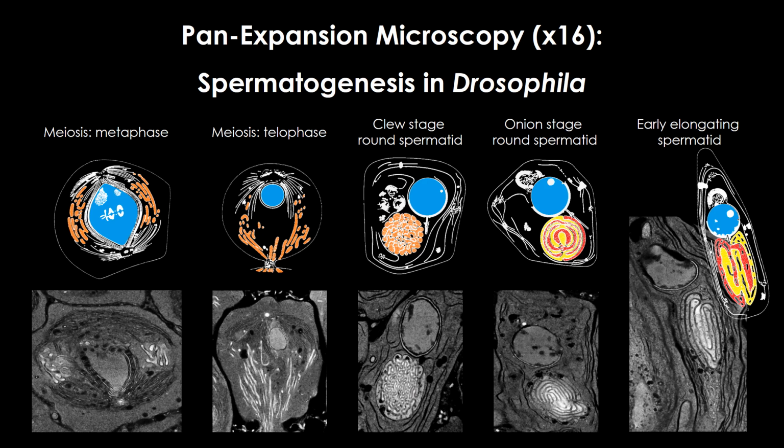In my hands, I was only able to stain with a certain anti-GFP antibody to visualize membranes of the mitochondria, because one of my proteins is fluorescently tagged with GFP. But I wasn't able to apply other antibodies, although in the original paper that described this technique, they have several other antibodies that they claim work fine.